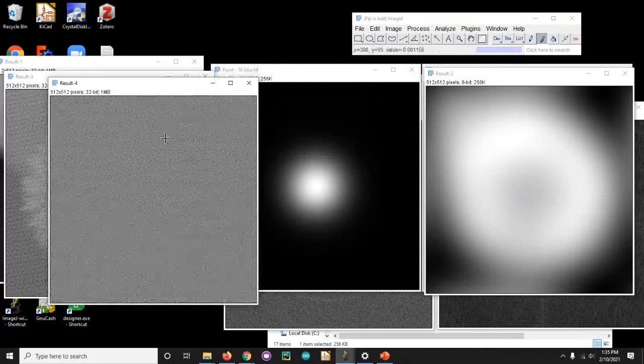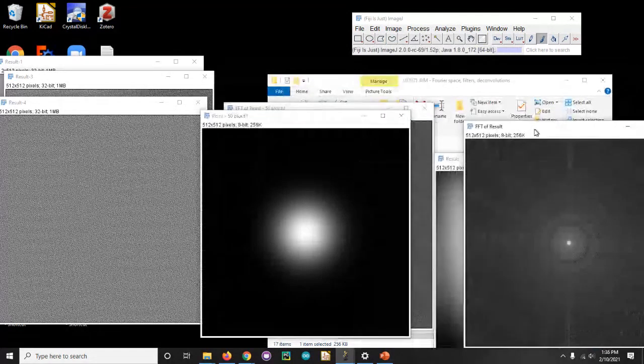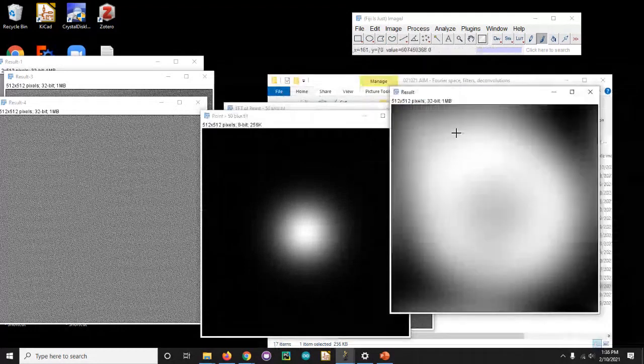So if we go back to then how did the original one perfectly deconvolve? Did I lose it? Close it. There it is. So if you look up at the title bar on the ImageJ, you can see the pixel values of this are in the hundreds of millions. This is mind-boggling dynamic range. To get the equivalent of this on, say, a confocal microscope would take weeks, if not months, to collect this intensity somehow without your sample photobleaching. This is an untenable dynamic range.